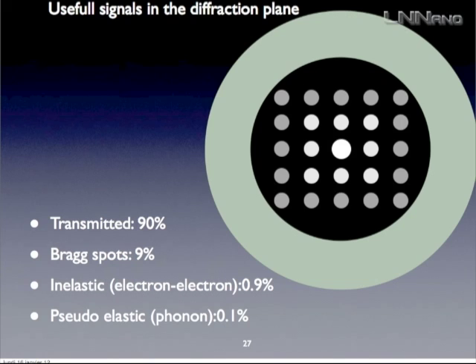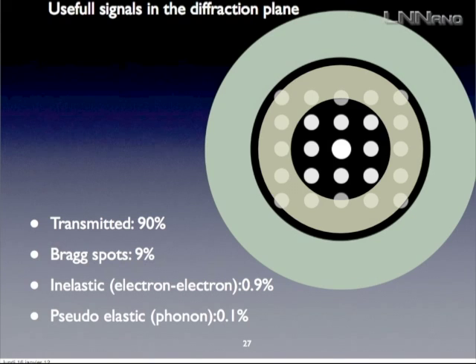And as we will see, bright field will be mostly here, and high angle annular dark field here, and in most of the STEM, in fact, people are using a little bit, or sometimes maybe a little bit too much, also the bright spots for the dark field imaging.